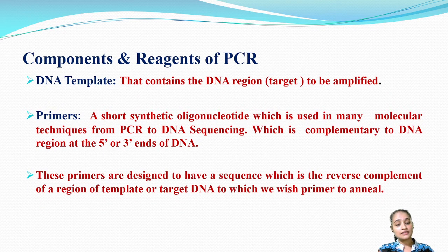These primers are designed to have a sequence which is the reverse complement of a region of template or target DNA to which we wish the primers to anneal. So the primers should be complementary to your DNA target so that they can get annealed to your DNA template.